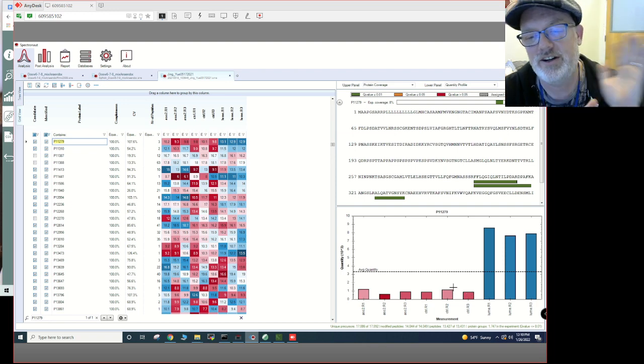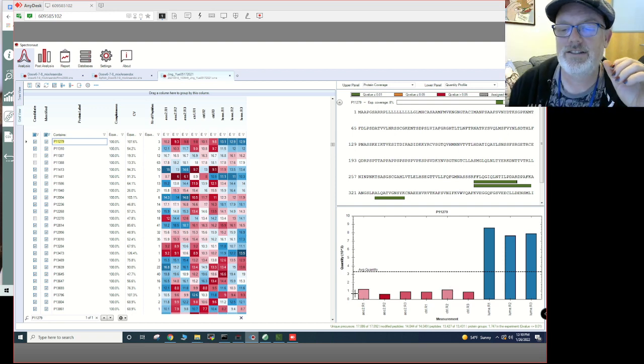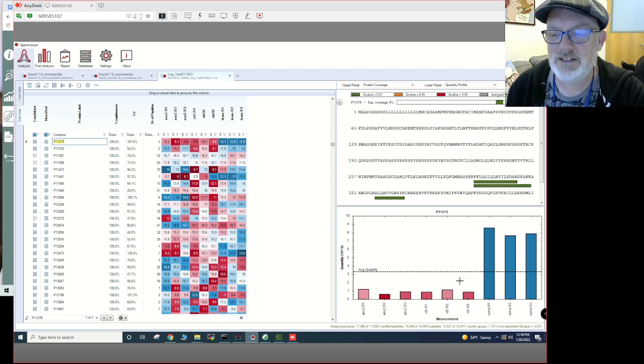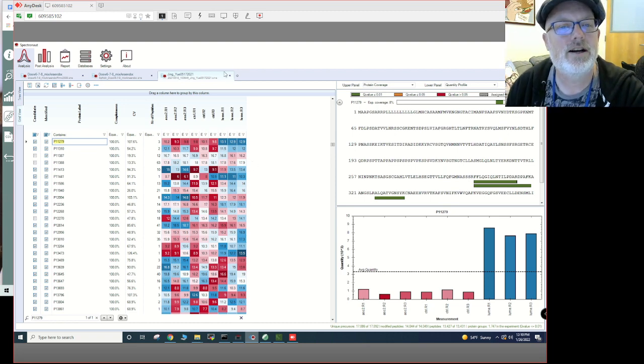Basically, Spectronaut does a very fancy form of imputation that kind of gives everything a low signal. I think it does a random sampling within 3 standard deviations away. This is all in the manual. I should read it again. Clearly, by my eyeballs, I say it's differentially expressed. If we looked at a box plot, you could see the whiskers were far apart. So the t-test is going to be significant.